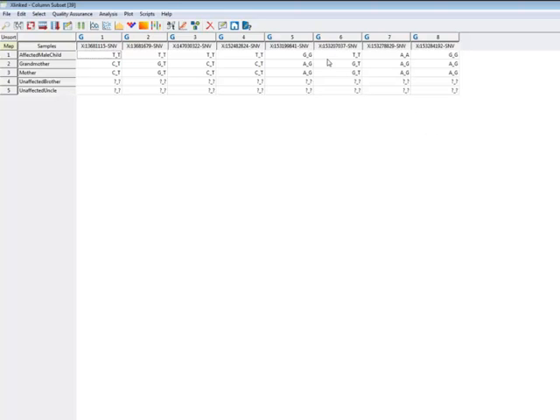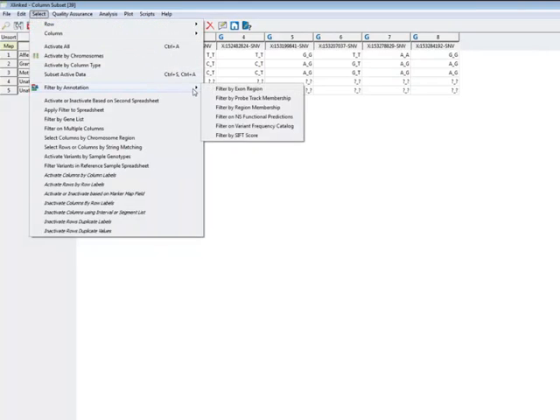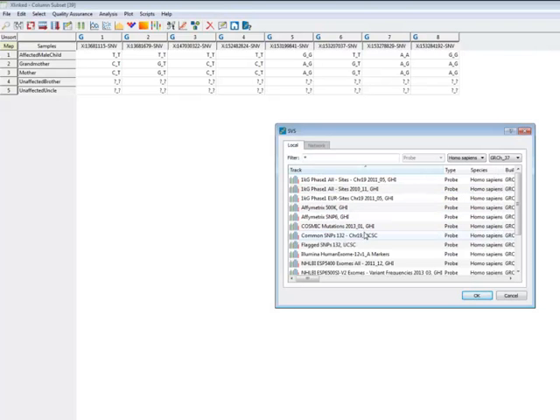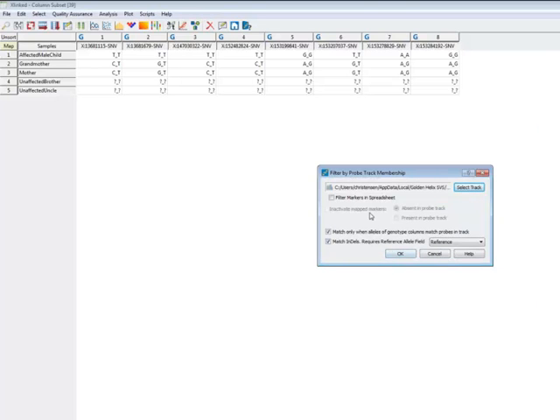To begin, I want to find out if they are common or rare. So I have a tool here that will let me compare it to the NHLBI variant frequencies. So we'll just grab that track right down here. And I think I'm all set up to go, so we'll let this run.